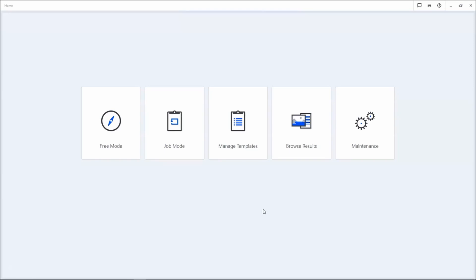Hi, my name is Ann-Kathrin. I'm a product manager at Zeiss Microscopy and I would like to show you how to set up XenConnect.